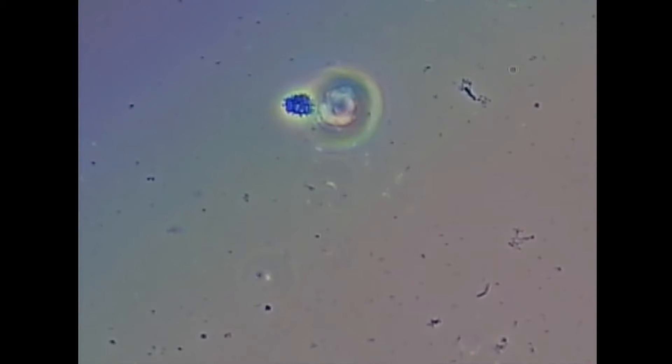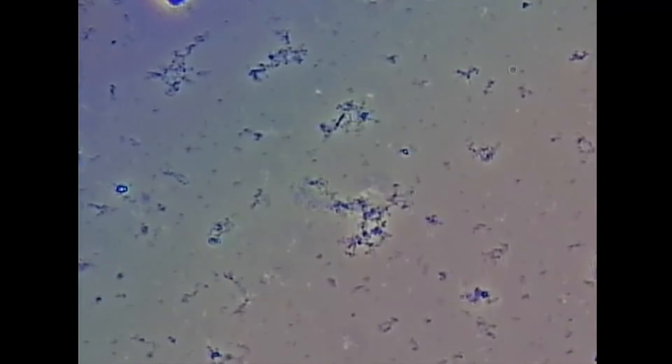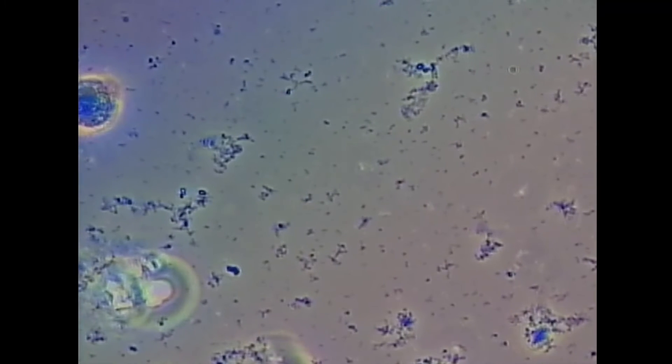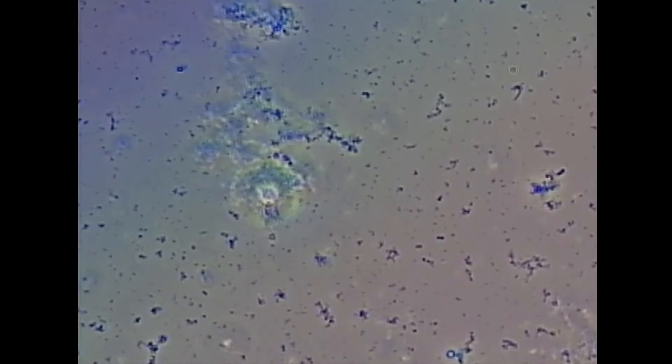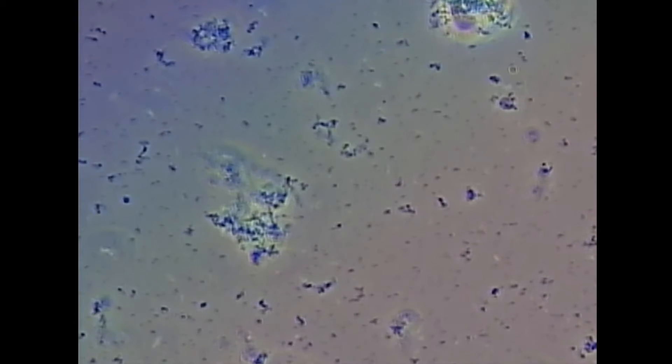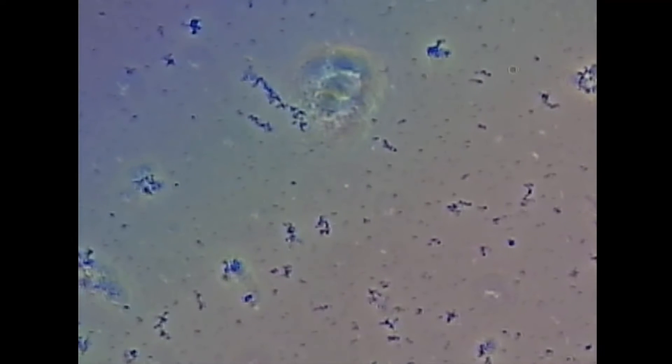Red blood cell there. I don't see any trichomonads or spirochetes. The patient is maintaining well with baking soda, a Waterpik, and an electric toothbrush.